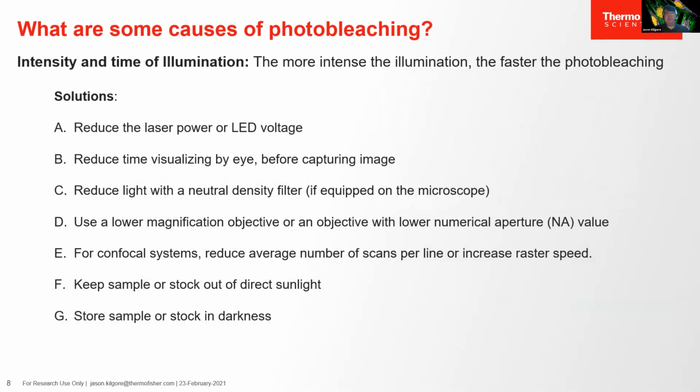Another cause of photobleaching has to do with the settings that you're using and the environment that you're working in. Arif just mentioned how you want to optimize your settings on your imaging system, but this is also true not just for getting the best signal to background, but also for reducing photobleaching. For instance, the best thing you can do is limit the light exposure, so the intensity of light that's hitting your sample.